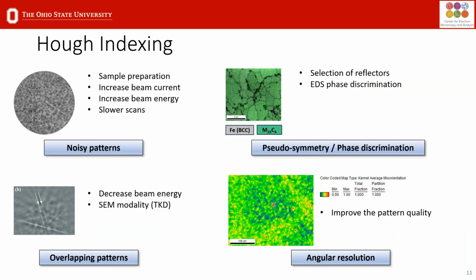Now, there are a number of practical ways that you can improve the performance. So usually if people come and we see that the patterns are very noisy, that's related to the sample preparation.